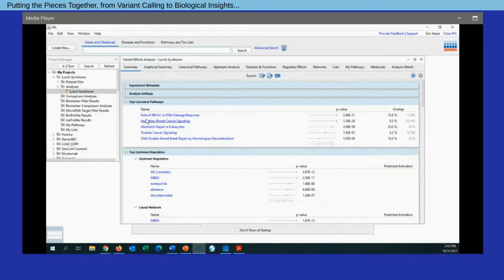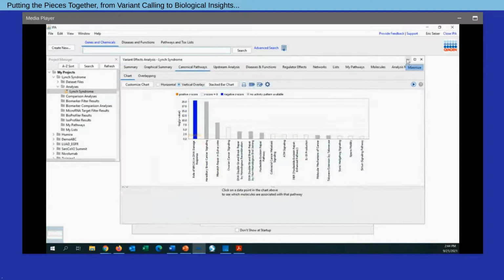We can see role of BRCA1 in DNA damage response, hereditary breast cancer, mismatch repair in eukaryotes, DNA double-strand break repair by homologous recombination. All different characteristics of DNA damage we associate with Lynch syndrome mutations, so that's a good biological confirmation of our findings. And in fact, we can interrogate this information in further detail by simply clicking on the Canonical Pathways tab.